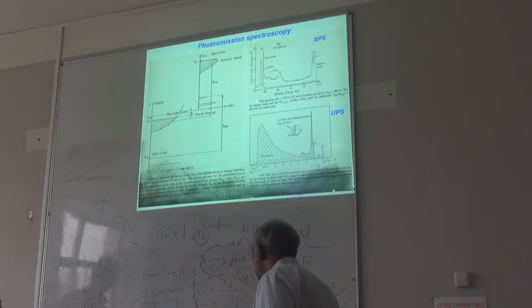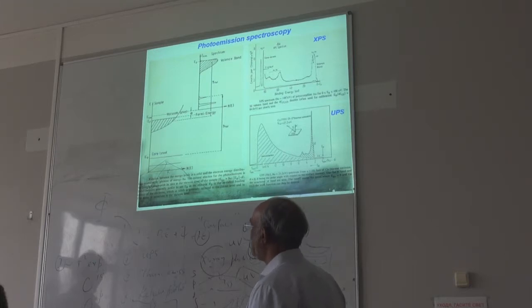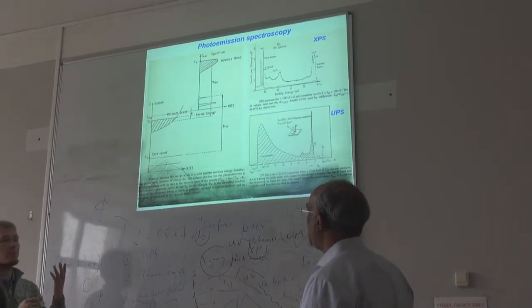One question. Many students understand about XPS and UPS. But for which purpose is it necessary, is it important to measure, for example, Fermi energy?